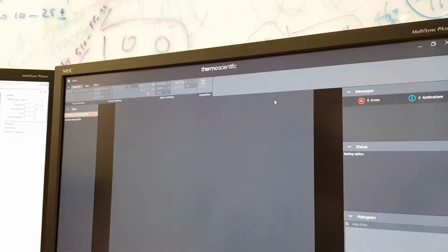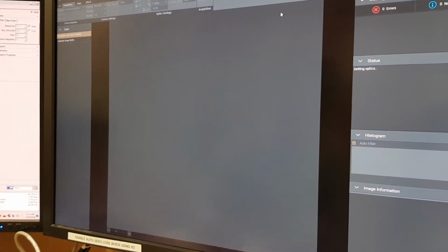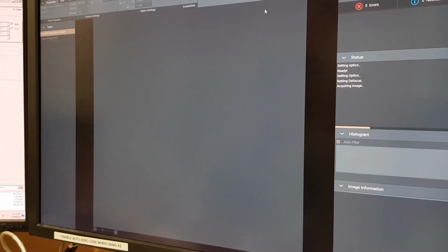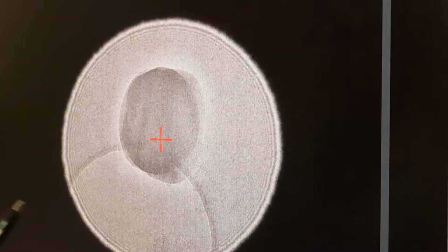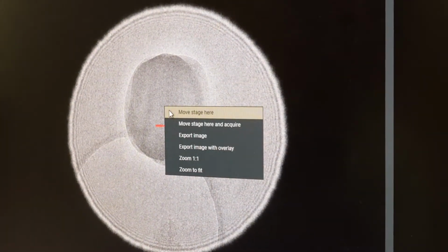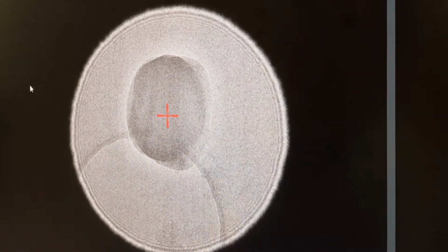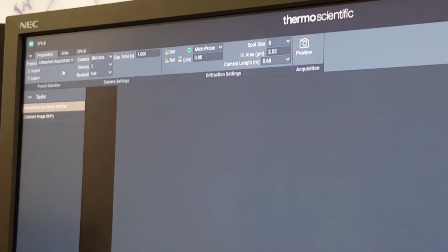This is a preset that we can use to locate our region of interest and set our optics. In the next preset, the diffraction pattern will share the same optical setting as your image acquisition setting. Yeah, that's good. You can see something in the middle of the beam. We can move slightly to the center, almost there. Then we can change to the diffraction acquisition.